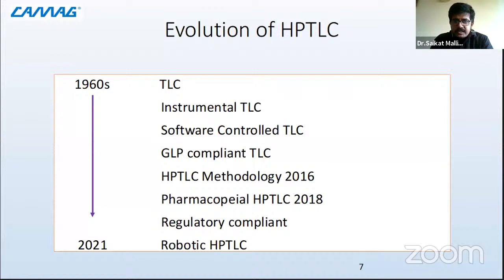So this is basically a separation science. And that is why thin layer chromatography was the most rudimentary but, at the same time, a very rapid benchtop technique which is being practiced. And definitely when you do your practicals, you will be undergoing this test because it is a very basic format of chromatography.